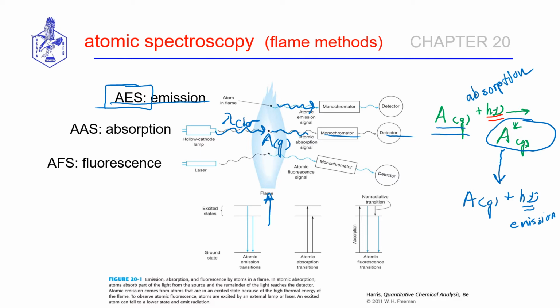Fluorescence methods are similar. The only thing that's slightly different, so schematically down here, the energy diagram. So we're going to excite with a characteristic wavelength for that element. Okay, your characteristic wavelength, excitation. And now a little bit of that energy gets converted to heat and is given off in the form of heat. That's what we call a non-radiative process.